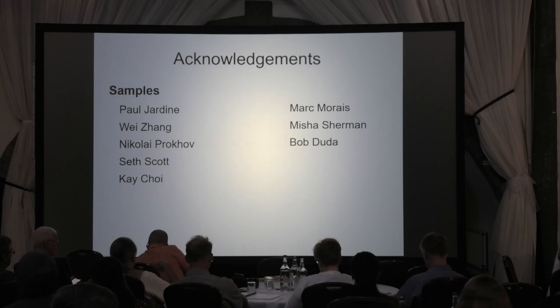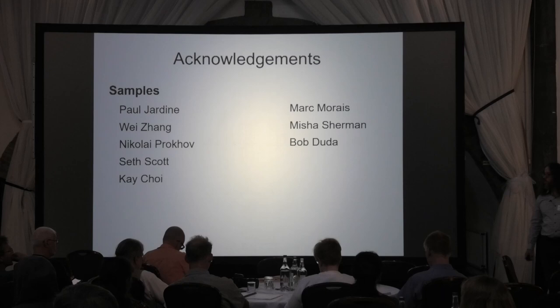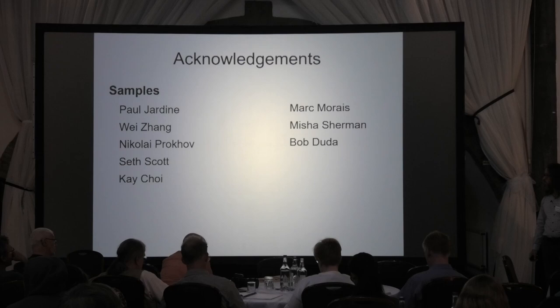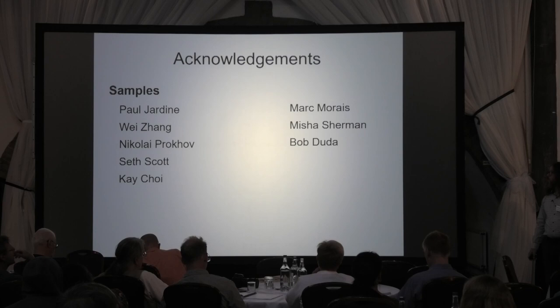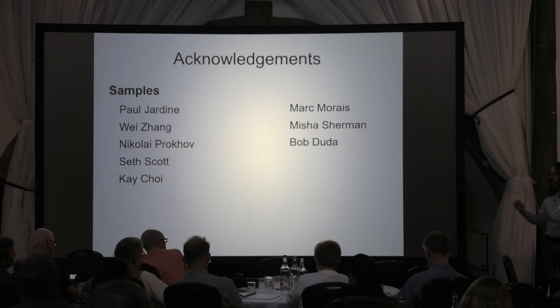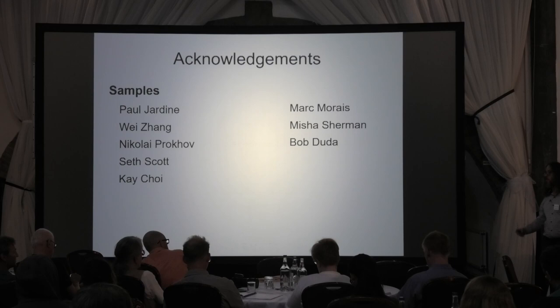So I was just curious, how did you assign the density to the scaffold? Did you do some quantitative proteomics to show there is nothing from the source which might account for some sort of peptide which would bind to the alternative scaffold binding places in the capsid? Because you mentioned two preps. Yeah, so I showed data from two preps. I've looked at at least three preps, and all of them have similar structures at the pentons. I didn't show it in the talk because I already ran over the time, but we can see side chain densities when the scaffold dimer is bound to the dimer site, so we can be quite confident that those arrowhead structures are the scaffold. We haven't taken any steps to rule out if there's something else there as well. It's possible.